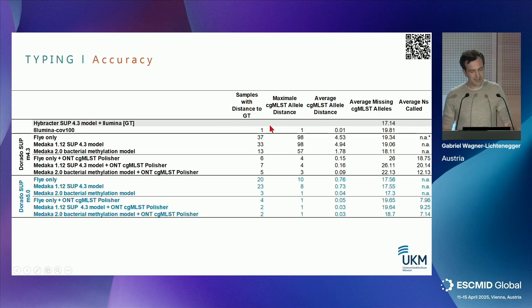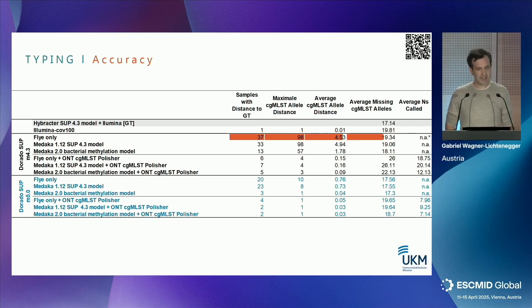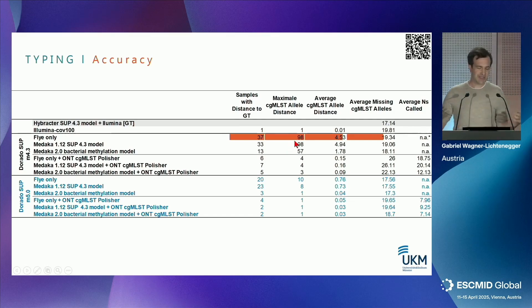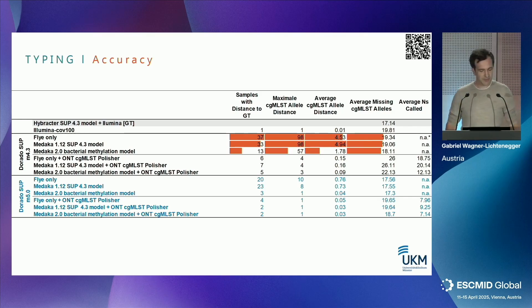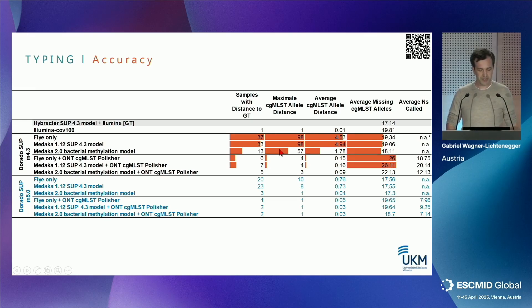The ground truth is on top — the Illumina data. Even for Illumina, out of these 80 samples, we had a single mismatch. With the old base caller and Flye assembly without any polishing, we had 37 samples affected, and the maximum distance from one sample to its ground truth was 98 — that's very high, because the thresholds used for cluster analysis are somewhere between 10 and 20. Polishing improved this somewhat, and the really big improvement came from the bacterial methylation polishing. Applying the cgMLST polisher on top of all three options reduced results to five samples with a maximum distance of three, which is fine.